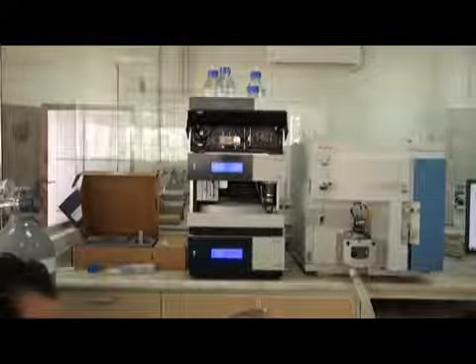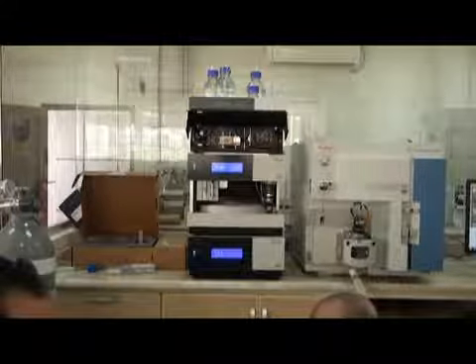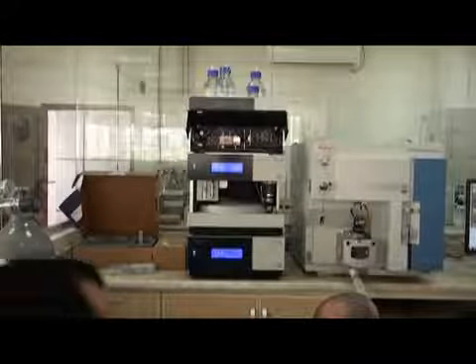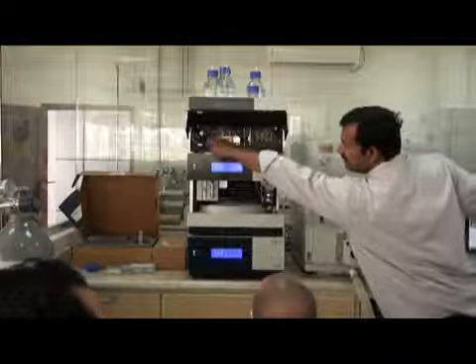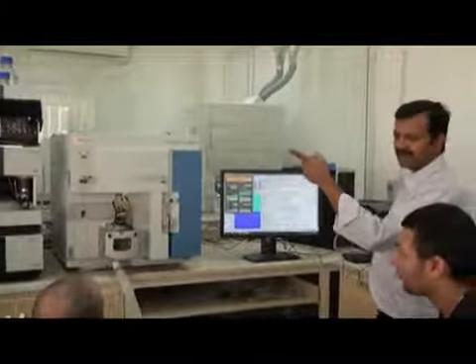And then more option. And then start. No, sorry, not this one. Rear seal wash. Start this one. Okay? Make active. When I press enter, see, this small pump will start working. This is the small pump. Manually. Yes. See, the pump will start working.